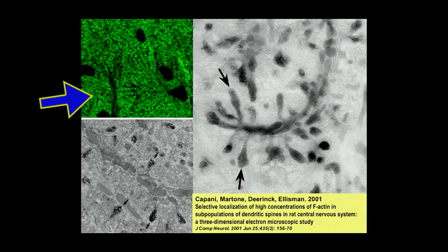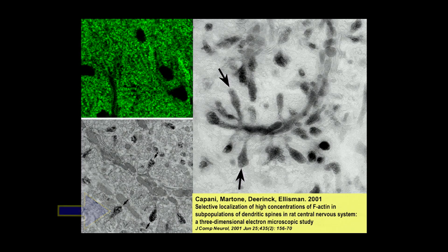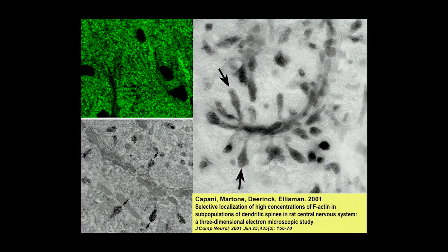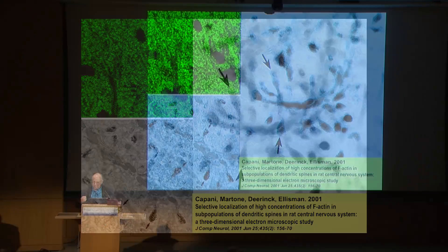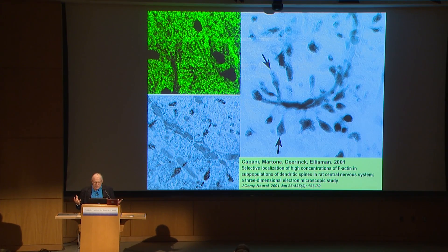If you switch to the eosin phalloidin, that's the light microscopy actin — looks like it's all over, but it's not actually. It's concentrated in the spines. And if you punch through it — this is not a tomogram, it's just a projection — the spines are full with this flocculent material that's actin. It's not just filaments. Like we know in cells now, a gel actually forms dodecahedral plates.